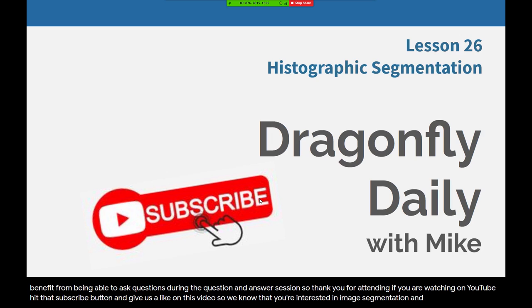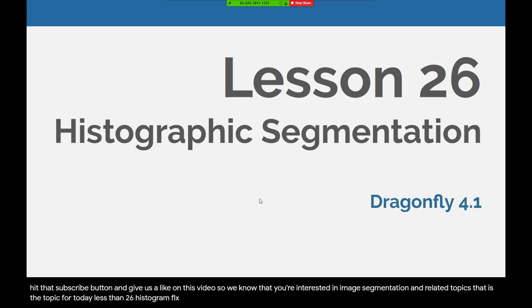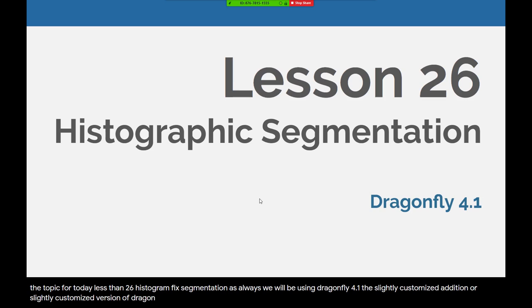That is the topic for today: Lesson 26, Histographic Segmentation. As always, we will be using Dragonfly 4.1, the slightly customized version of Dragonfly that we set up in Lesson 6, Customizing Dragonfly.